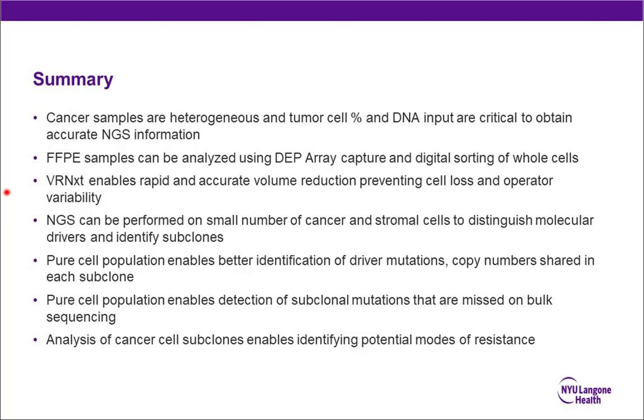How important is the variability from single-cell heterogeneity in your liver metastasis research? That's a great question. That's something that we're working on right now. Our original analysis was focused on small pools that range between 50 cells to 120 cells, and now we are doing a single-cell analysis to see how much variability there is at a single-cell level.